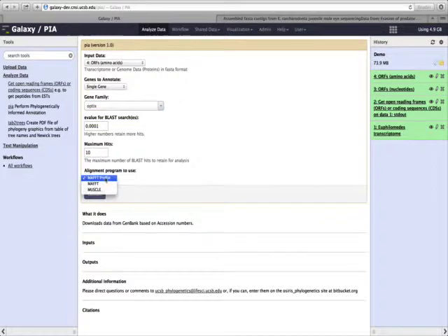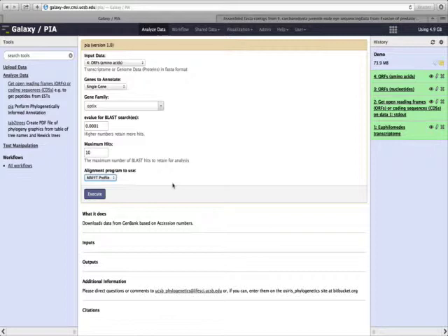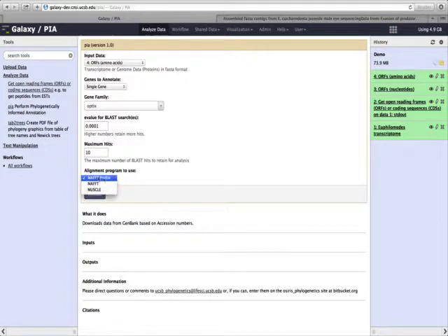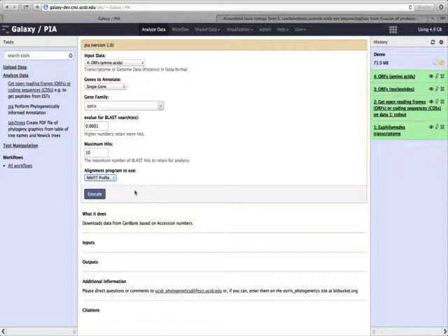We also have the choice of different alignment programs, and the default is MAFT-Profile. A profile alignment doesn't realign all of the genes. It just takes the new hits and aligns them to an existing alignment, so it's much faster. But these other two, either MAFT or MUSL, will realign all of the genes before calculating the phylogenetic tree or before placing the hits on the phylogenetic tree.